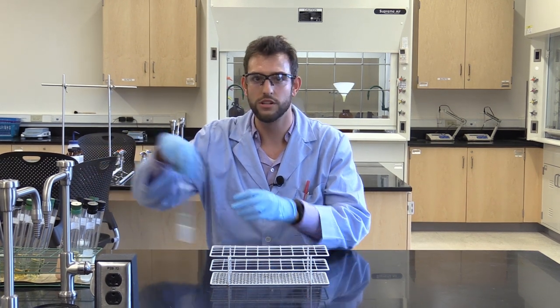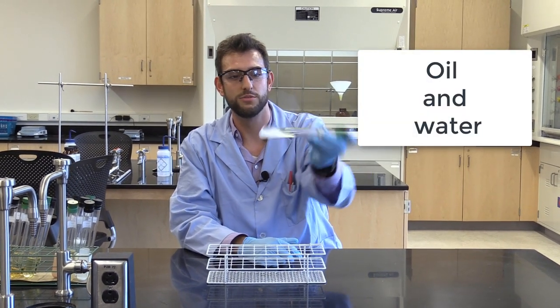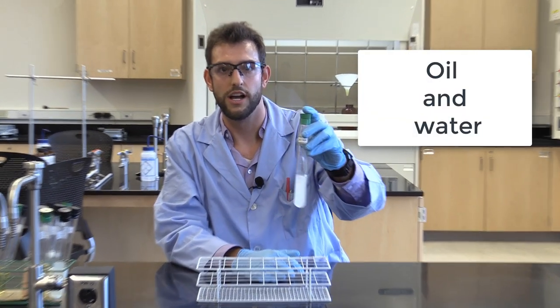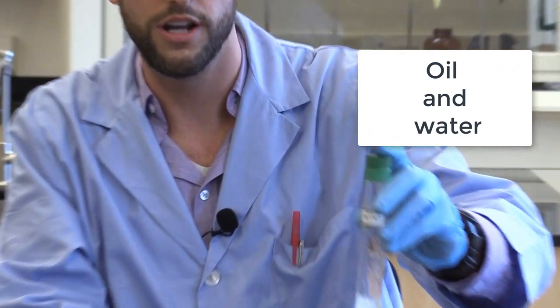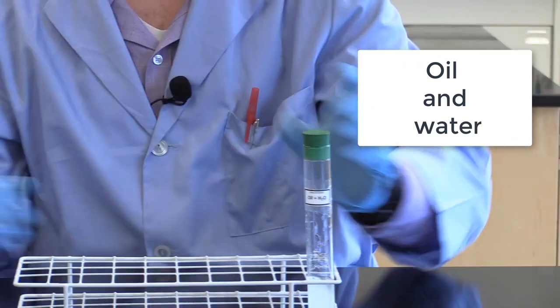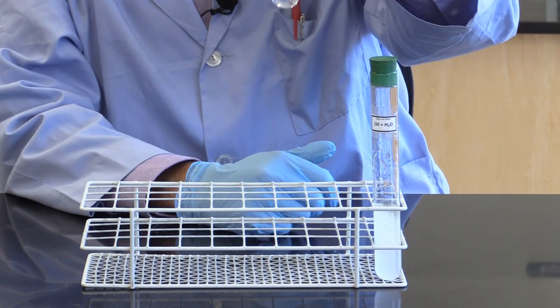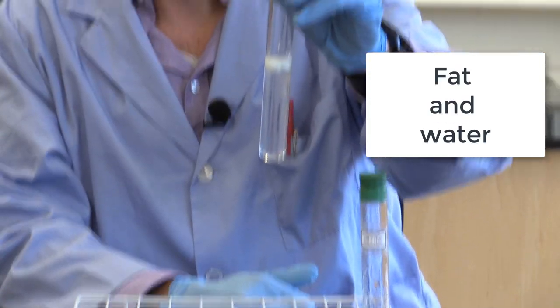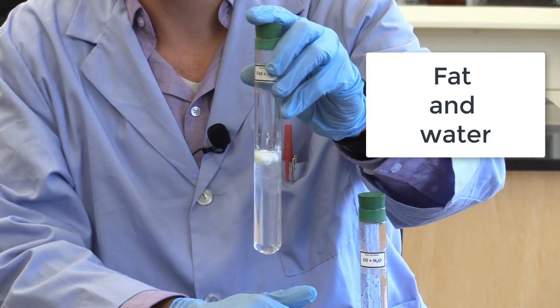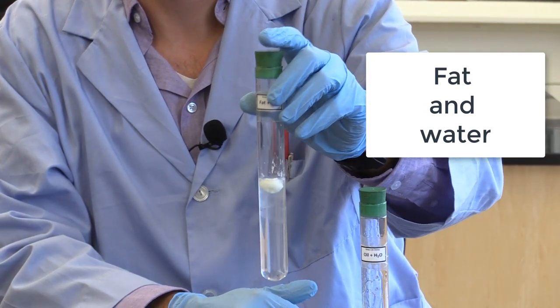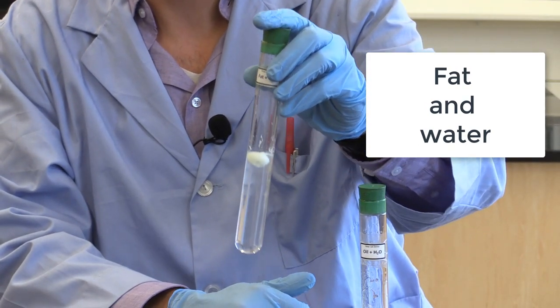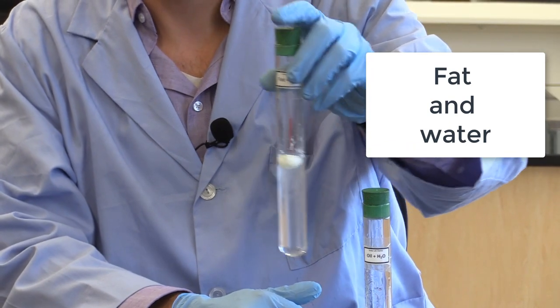First, we will look at oil and water. As you can see, they are not soluble in each other, as oil is nonpolar and water is polar. Fat is extremely insoluble in water, as you can see in the second tube. Fat has a longer carbon chain, which decreases its solubility. This is why you see a huge chunk floating at the top.